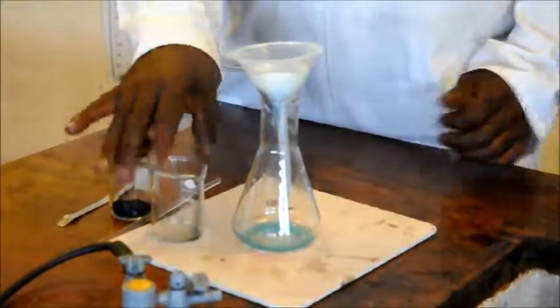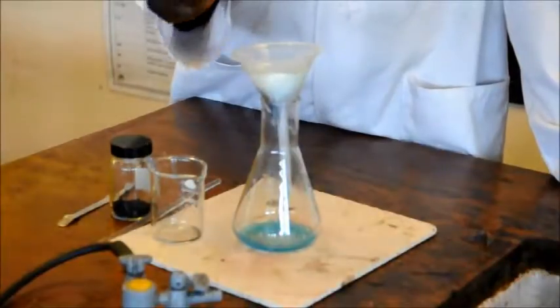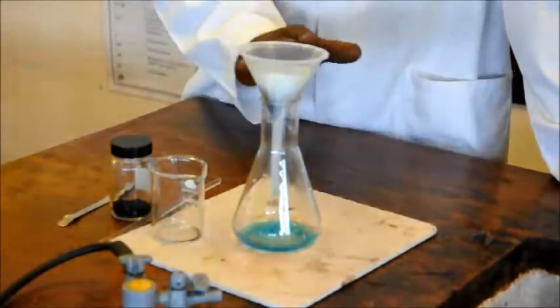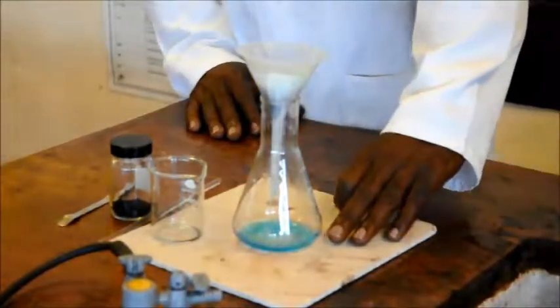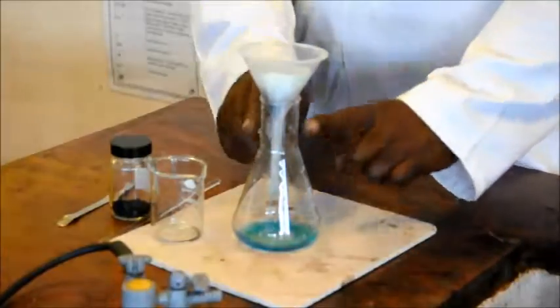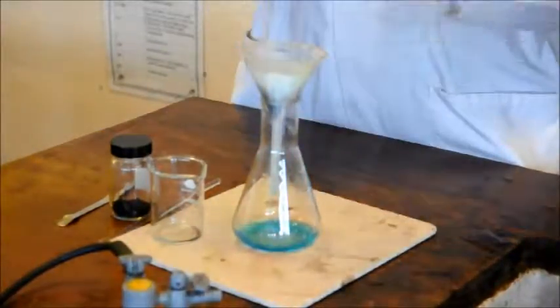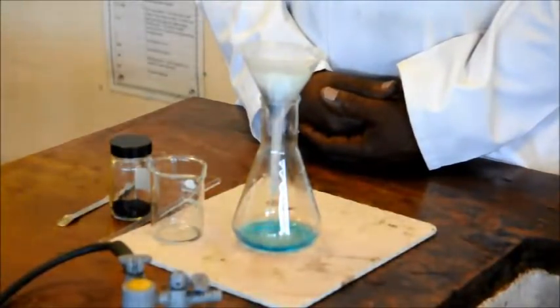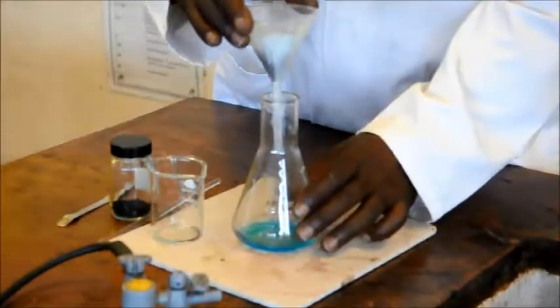That's it. Now, despite how much you're tempted to poke anything in there to help stir it up and move it on, do not push anything into the filter paper. It's just a matter of waiting for the filtrate to drip through into the conical flask, and what we'll be left with in the filter paper will be the residue, the insoluble material. It's not really too difficult, it doesn't take too long, and I think round about now it is done.